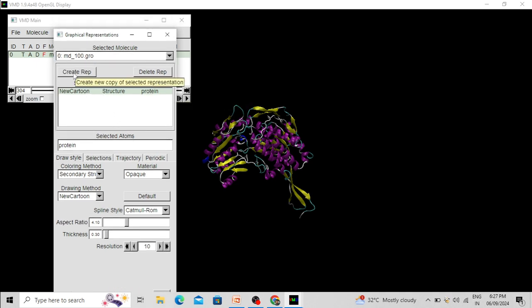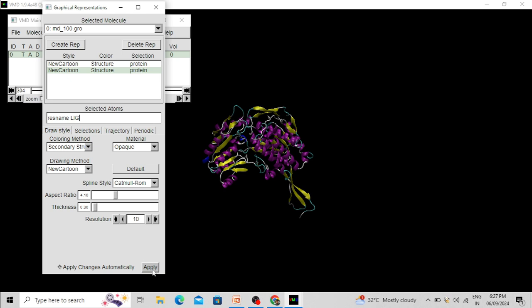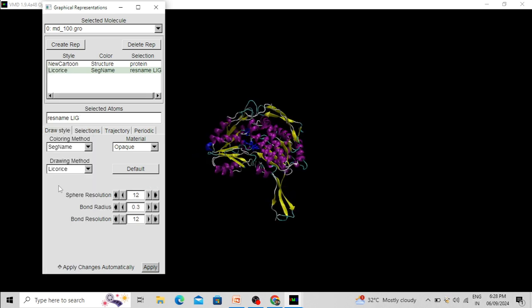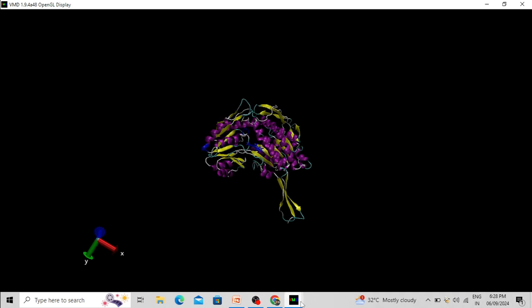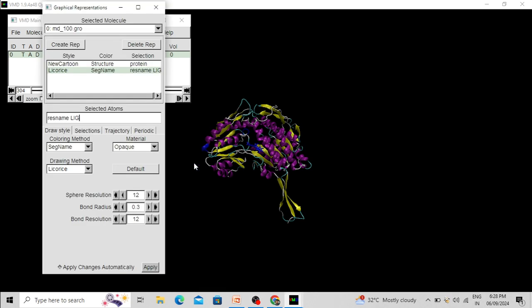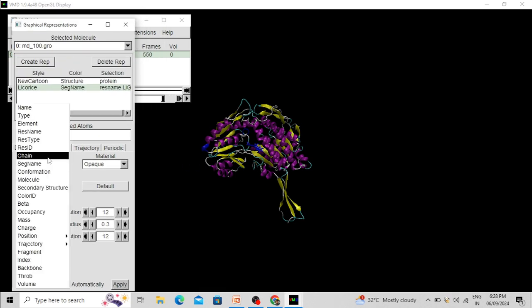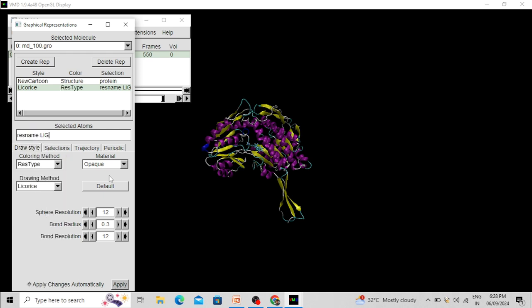If you want to add the ligand molecule, click Create Representation. Type the residue name — this residue name may differ in different molecular dynamics simulations. In my simulation the name of the residue is 'LIG', so type 'resname LIG' and click Apply. I am changing it to licorice and changing the color by residue type. You can select colors as you wish.